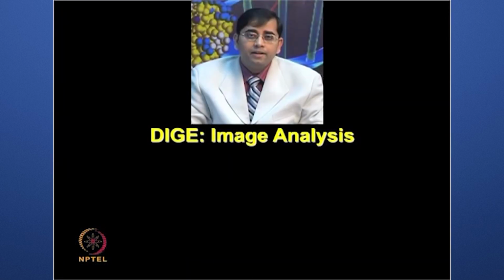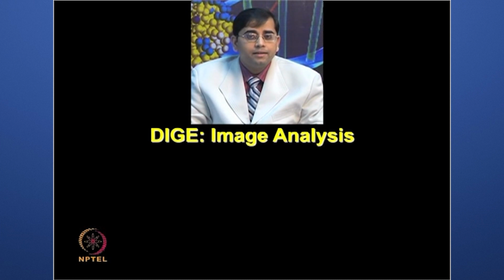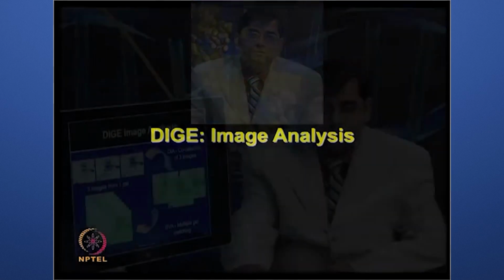So, DIGE image analysis, although it is a very software driven process, is much more automated as compared to 2D analysis, but it requires a lot of tools which can be used for good interpretation.